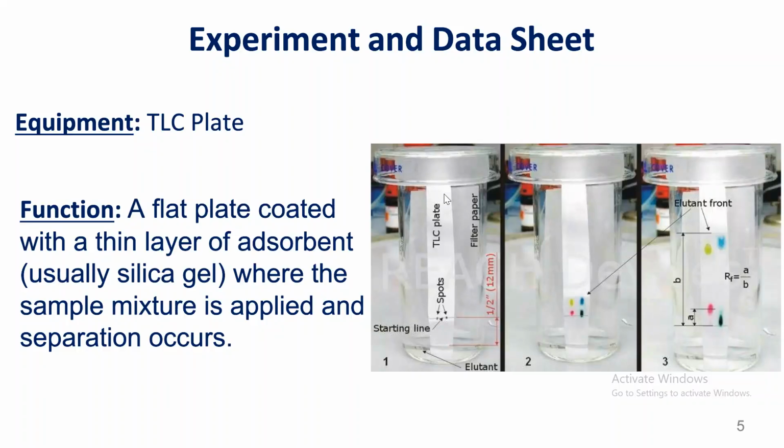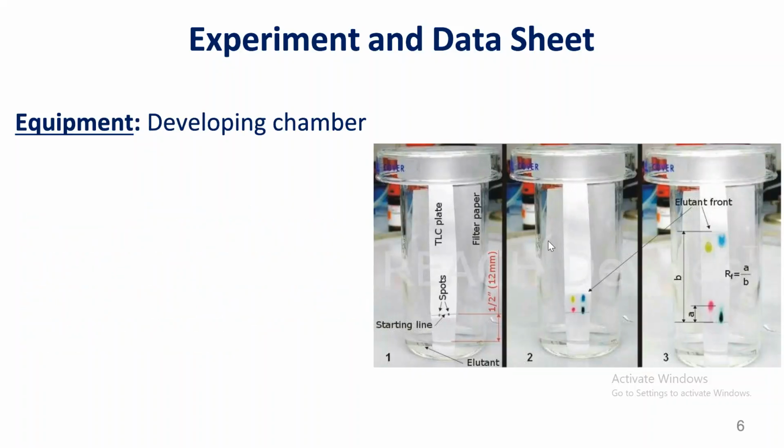If you look here in the slide, you'll notice that the TLC plate is this white plate right here, where we are going to place our samples, and we're going to see some separation of our mixture. The second equipment is the developing chamber.